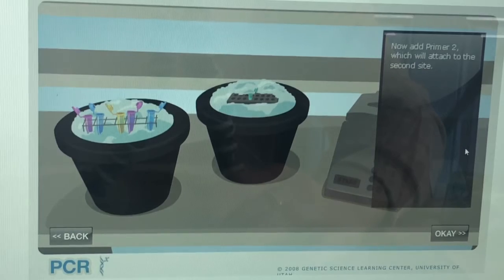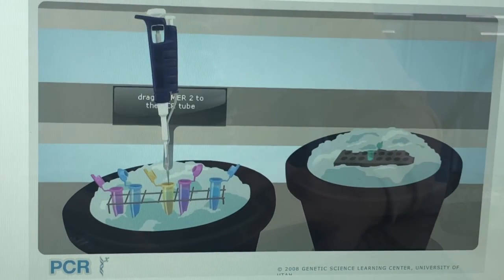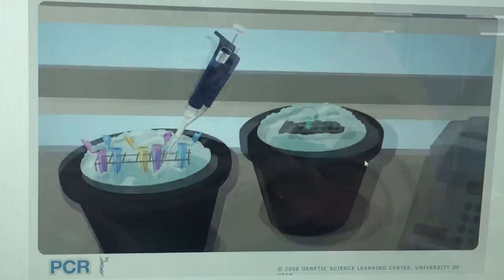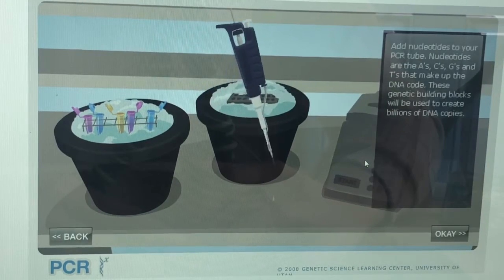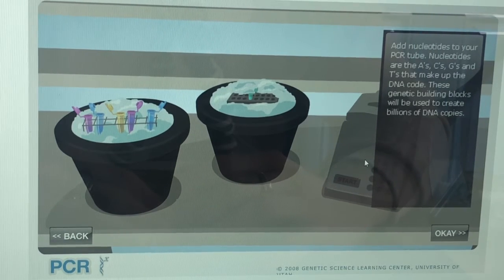Now add primer 2, which will attach to the second site. Add nucleotides to your PCR tube. Nucleotides are the A's, C's, G's, and T's that make up the DNA code. These genetic building blocks will be used to create billions of DNA copies.